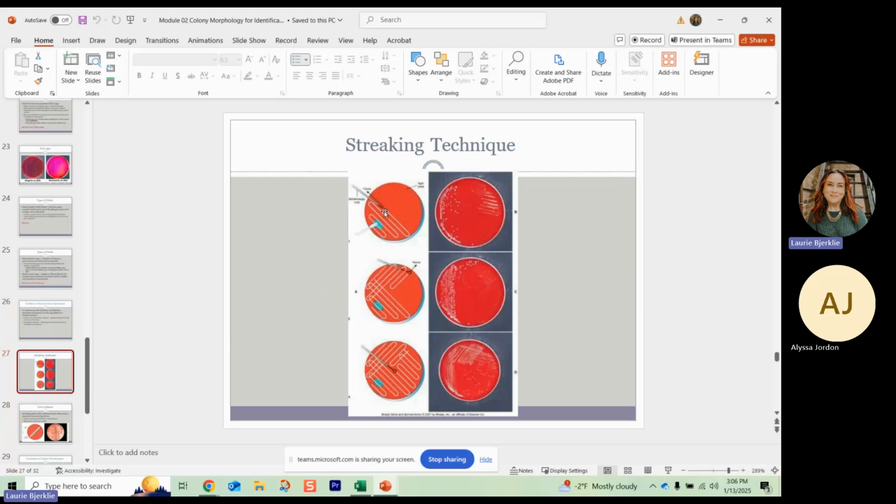Then you have what we call a loop that we sterilize in a Bacti-cinerator. So it heats it up, make sure the loop is sterilized. Once it's cooled off, then you go and you can streak out your secondary area. You got to make sure the loop is cool or you'll kill your bacteria. You will sizzle them out. You'll hear the sizzle if you don't make sure it's cool. So as you can see, what it does, and you'll learn this again in lab, is that you just go into the primary, pull out a couple of those strands, and then continue to streak.